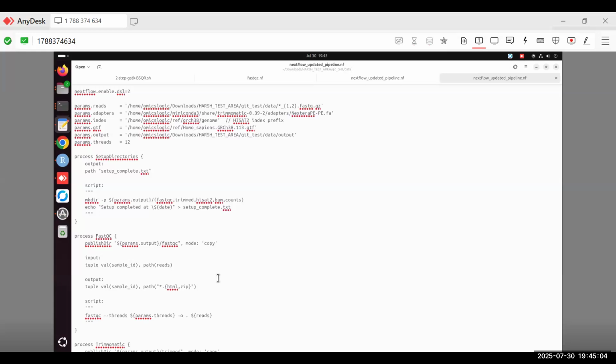I have a question here. Yes, please. Suppose we are doing this for multiple samples, how does the sample ID get picked up? No, you are not going to define it here. If you look at this, it's a star. Star is like a wildcard. We call it the wildcard parameter, it selects all.